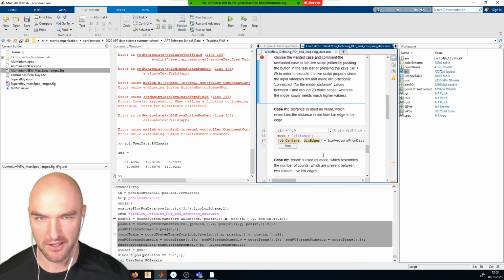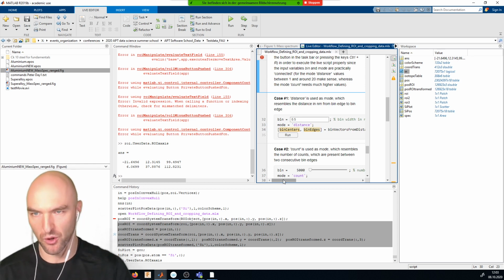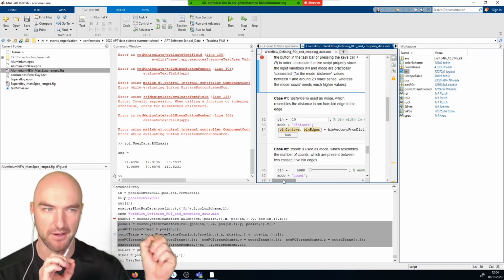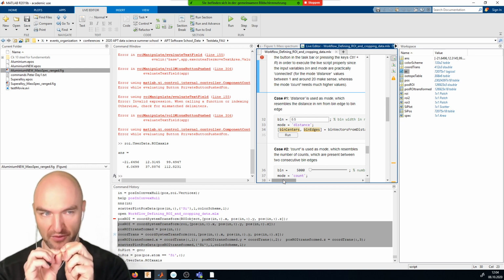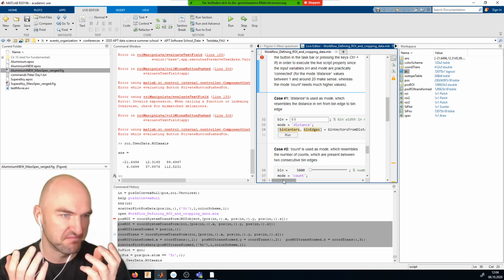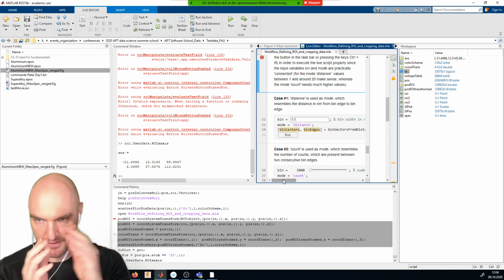I can then create grid vectors from it. And those grid vectors, we can have them based on a constant distance, and this is what we're going to use now. And for the radial profile, what we're going to do is we're going to use a constant atom count. Because otherwise, when we're right in the middle, we're going to have very, very few atoms within. Maybe you want to have a bin count of a tenth of a nanometer, for one bin.